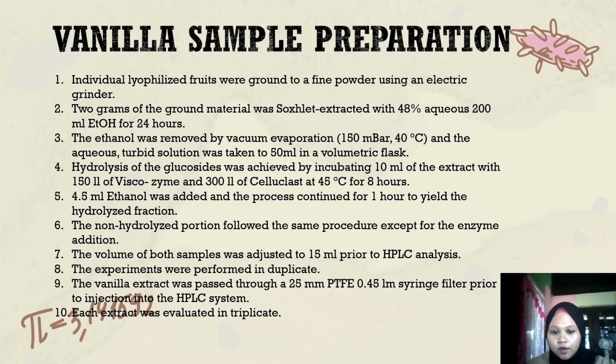Then the experiment was performed in duplicate. Then the vanilla extract was passed through a 25 mm PTFE 0.45 µm syringe filter prior to injection into the HPLC system. And the last step is that each extract was evaluated in triplicate.